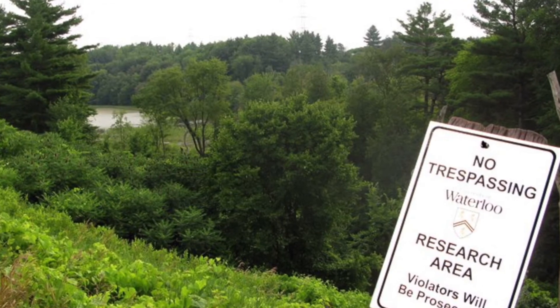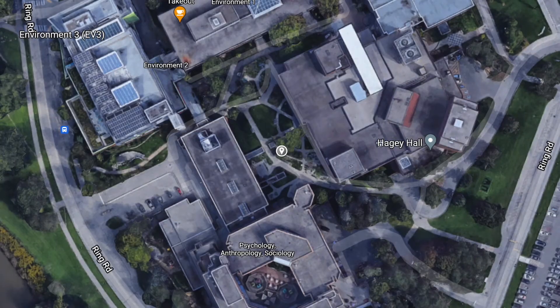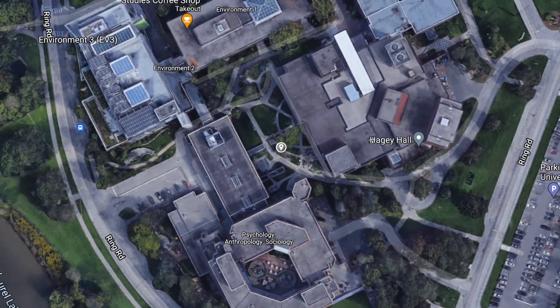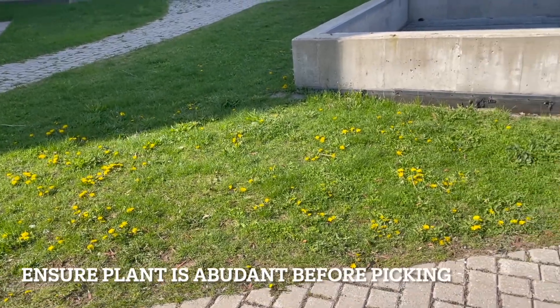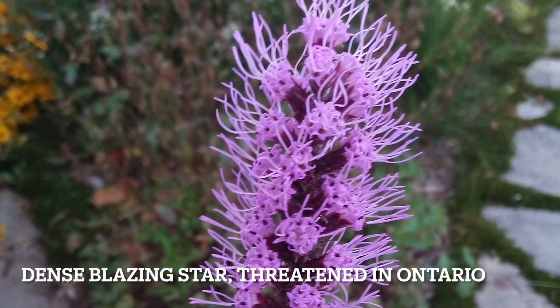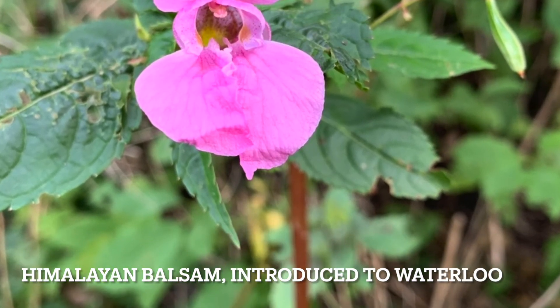Do not collect from private property or natural areas unless you have permission. Today we are in the Arts Environment Garden on the University of Waterloo campus, gardens which are maintained by the Ecology Lab. In addition, don't collect anything that is not abundant in the area where you are picking it to avoid removing rare species, unless you know that it is an introduced or invasive species.